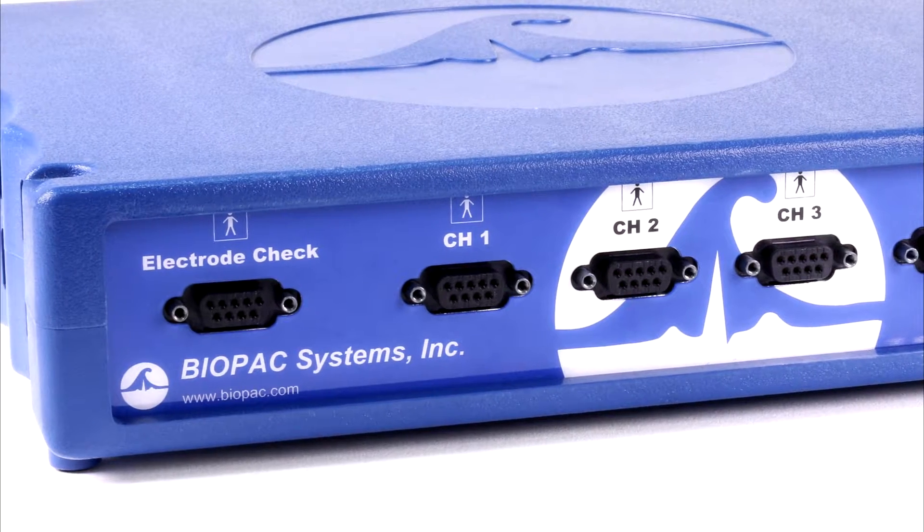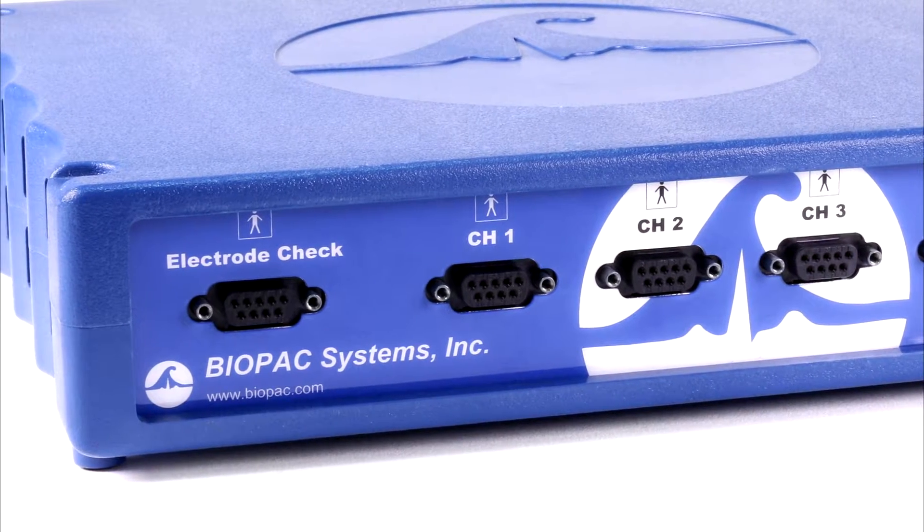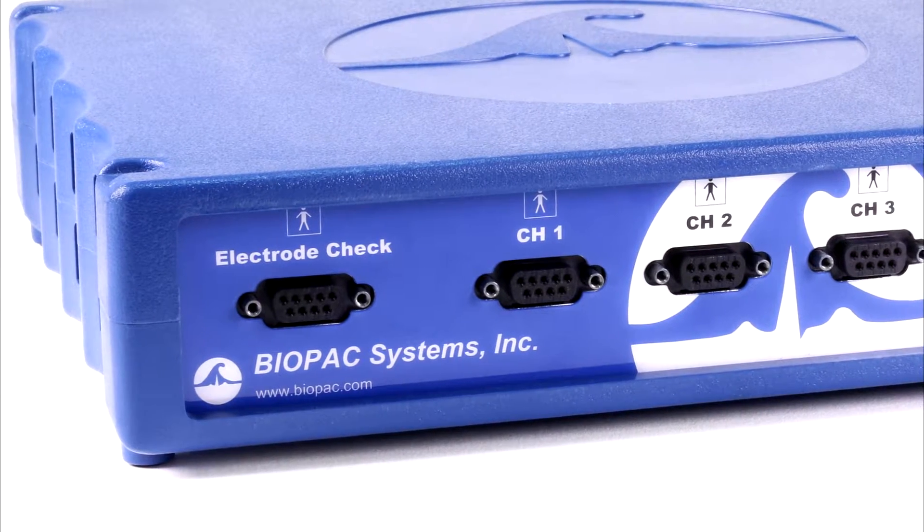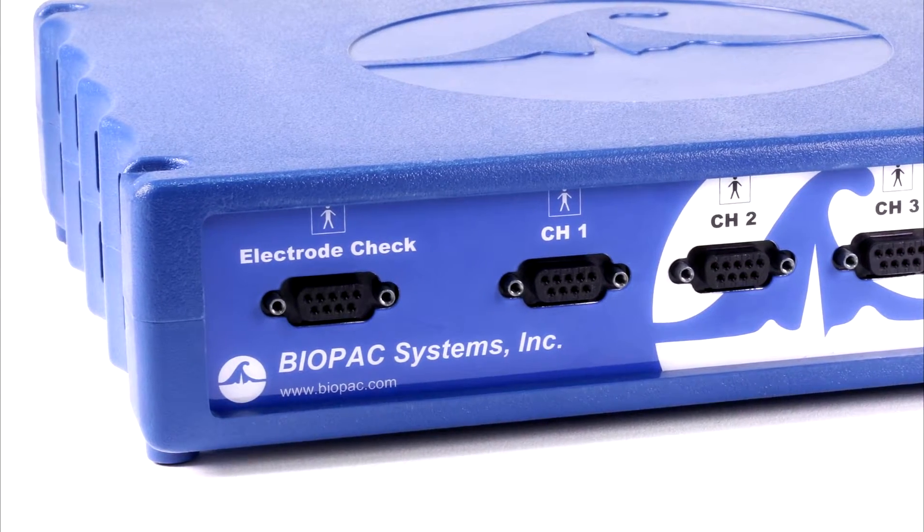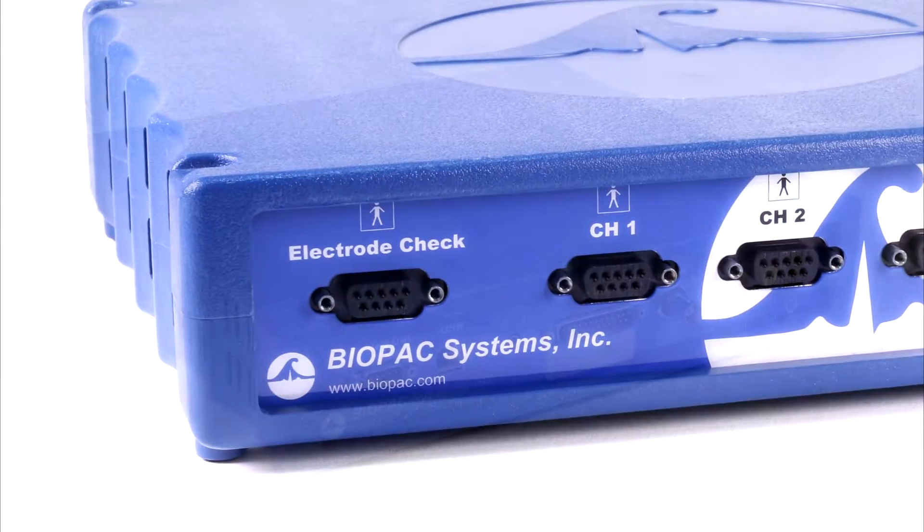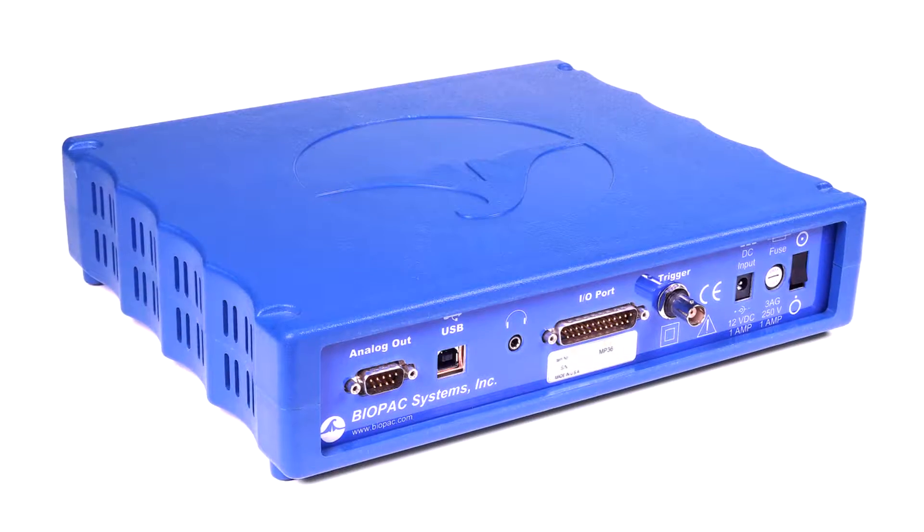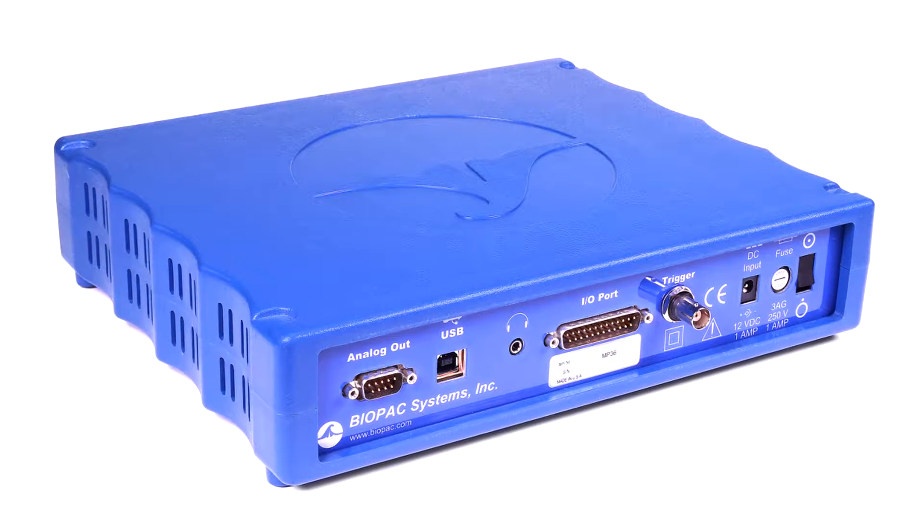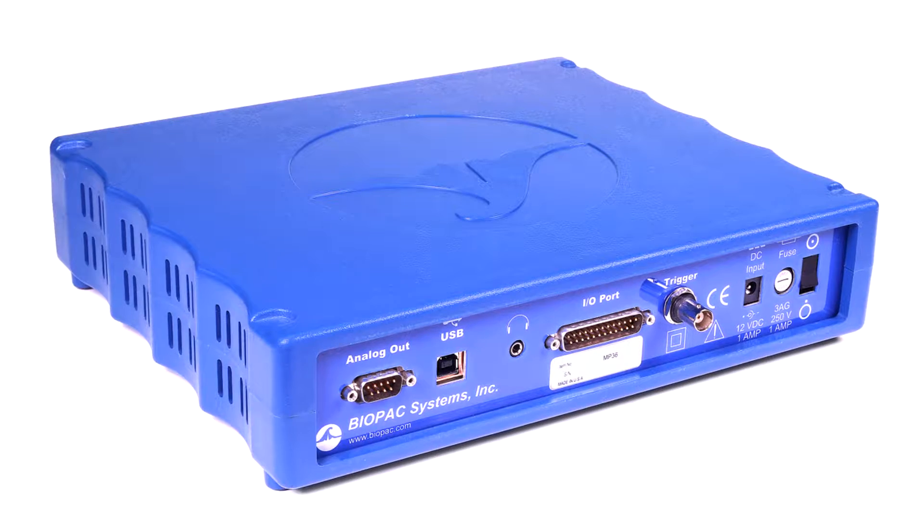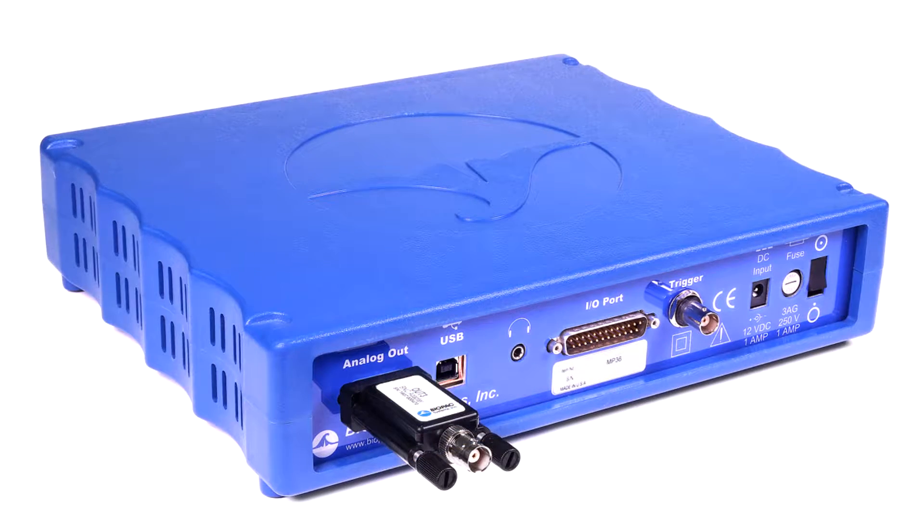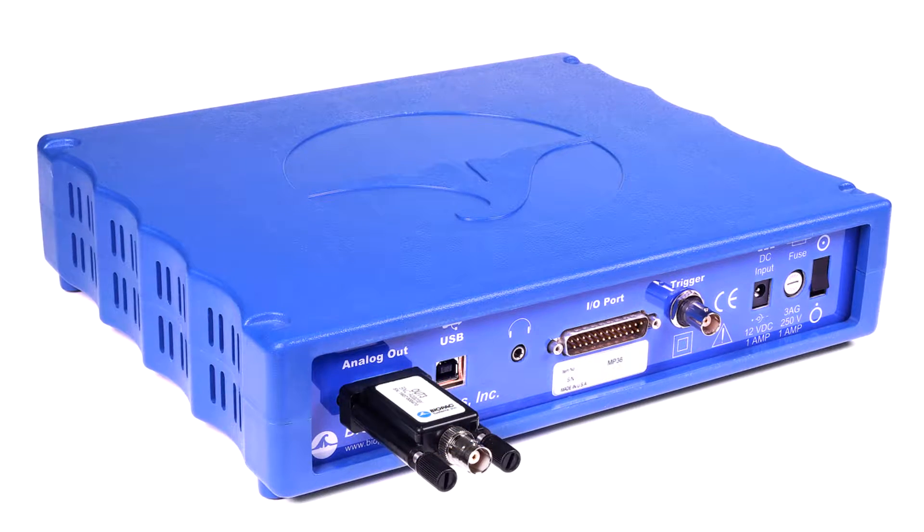The electrode checker confirms signal quality before recording begins to help students collect good data. The MP36 also has a built-in low-voltage stimulator for animal studies accessible by adding the OUT3 stimulator output adapter.